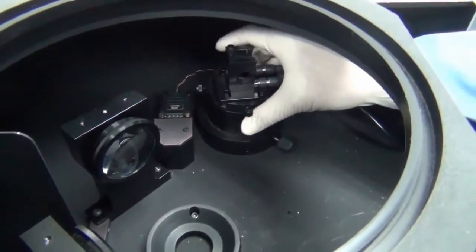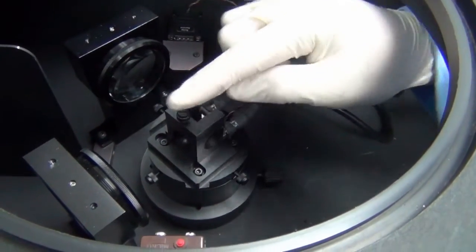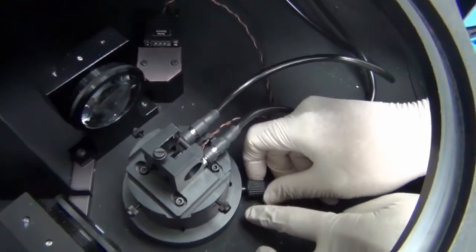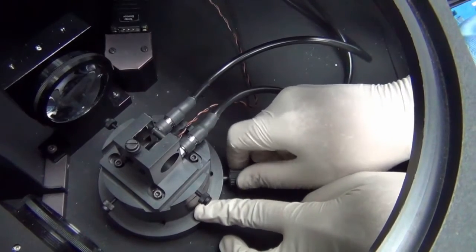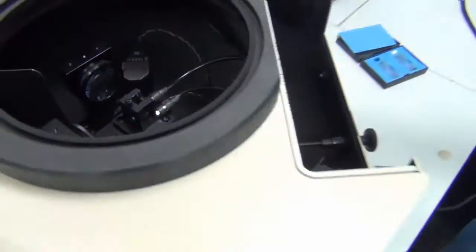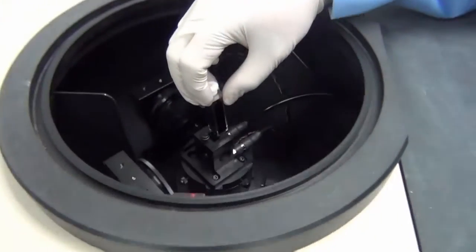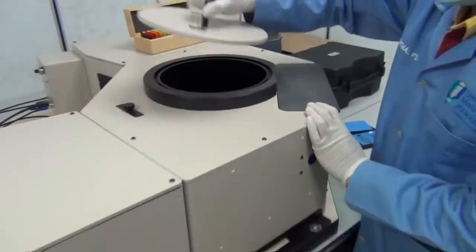This is the stage. Just take the stage and slot it over here. Make sure they are facing over there and to the other lens, and you need to tighten it up a bit over here. There is a screw over here, and there is a groove down there. You could simply feel the groove and tighten it up. Finished. Simply put this compartment back again and slot your sample over here. Done. Now close the lid.